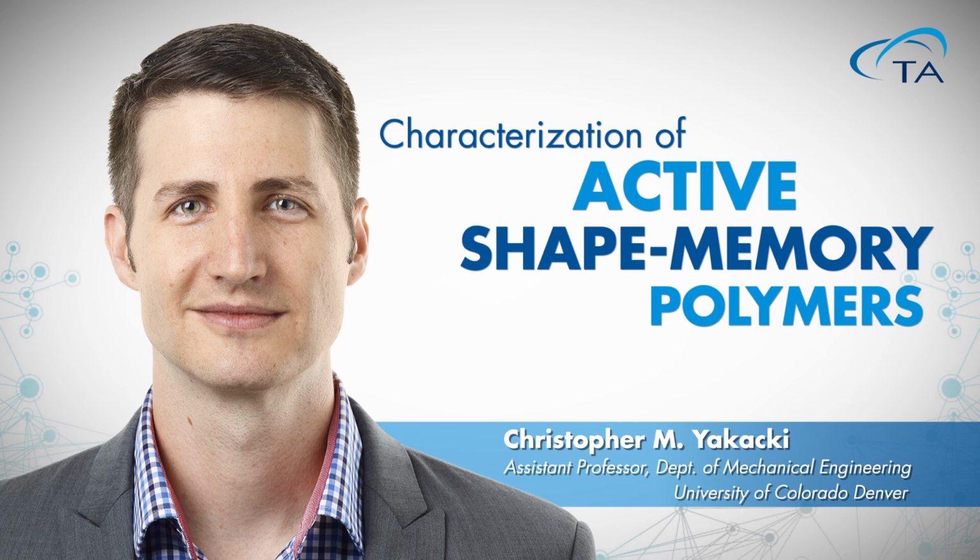So the next question comes from Laura, and she asks, are there any shape memory materials where TTS does not apply? Laura, that's a good question. I would say that if you're dealing with materials that undergo a unique melting transition, that's where TTS is going to break down. I can give two examples of that.